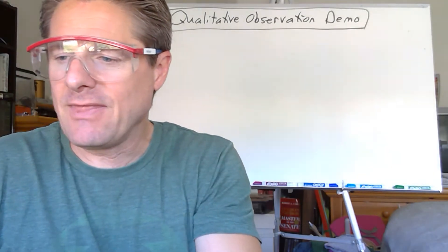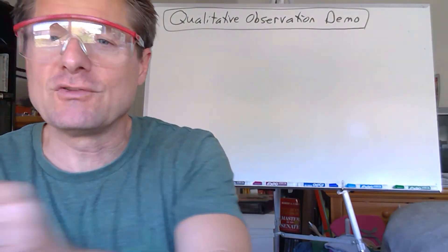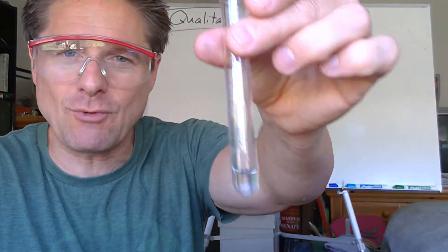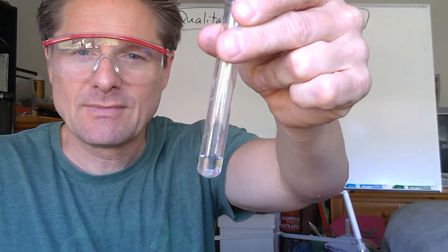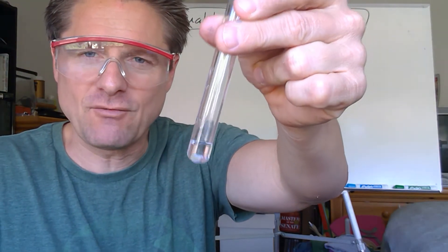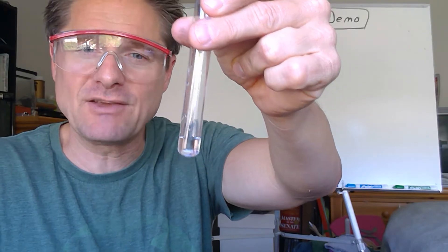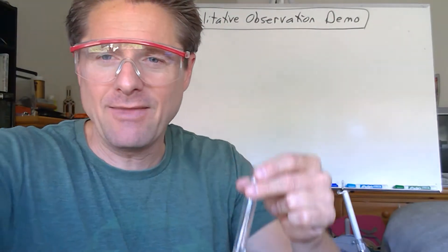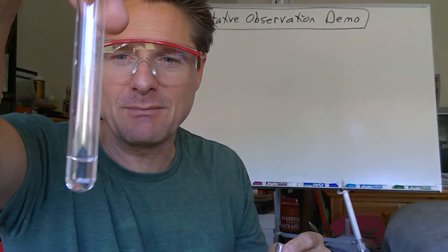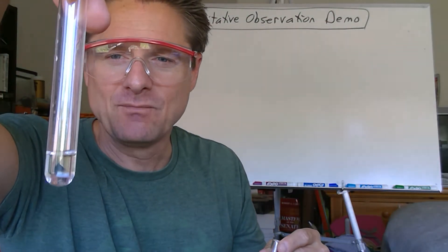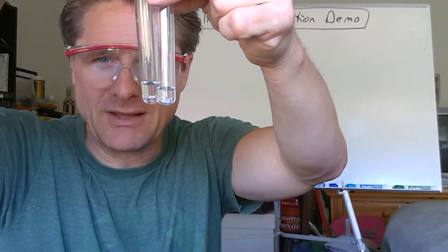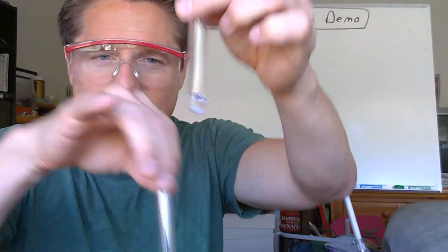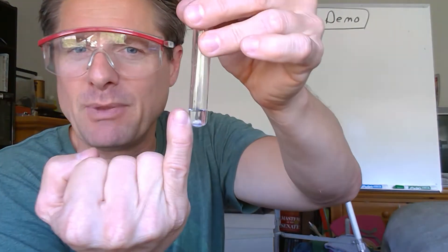What I'd like you to do is practice — pull out the qualitative observation handout and try to describe the lead(II) nitrate and the potassium iodide yourself first. I'm going to try to get these to about one milliliter each. A milliliter is about the size of your pinky fingernail.